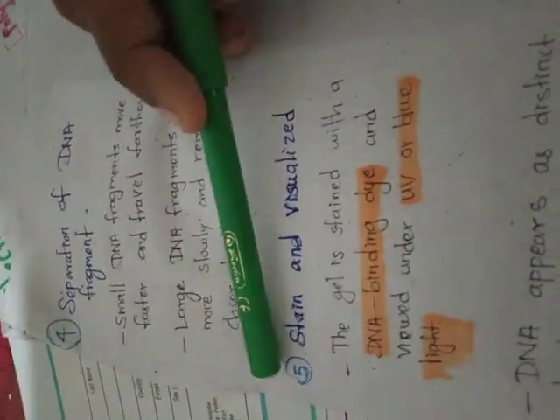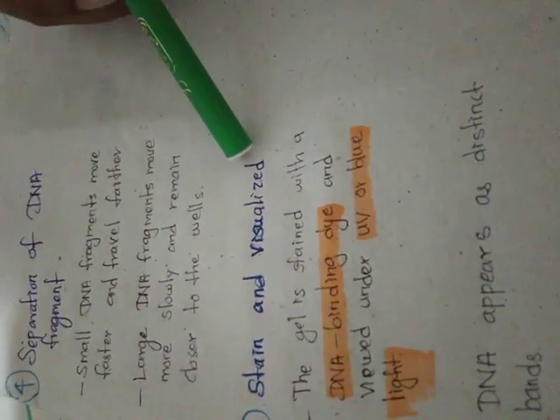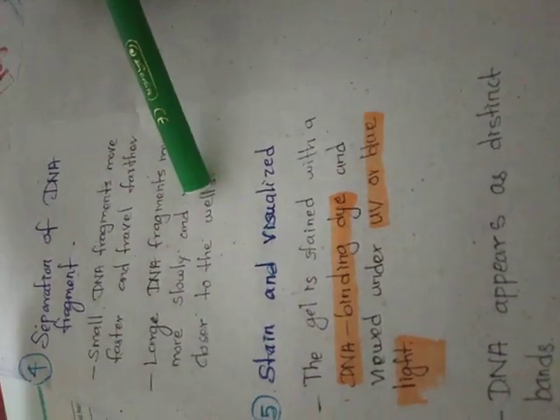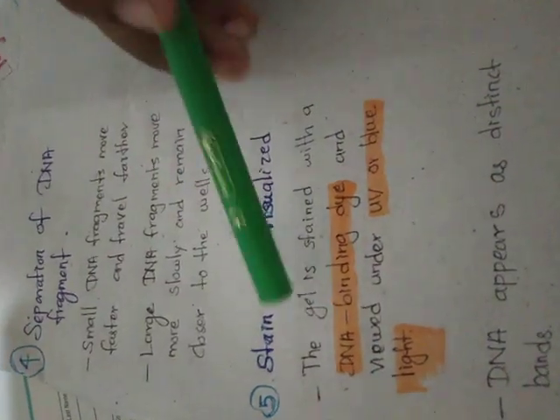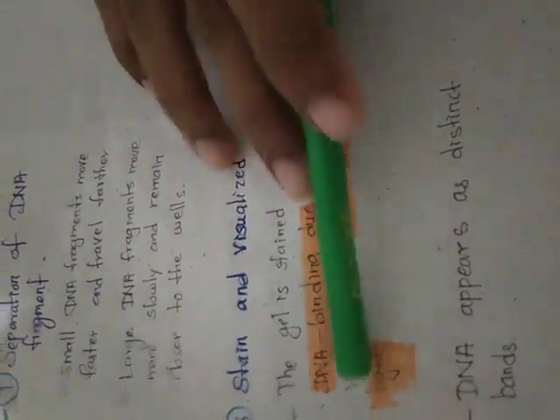Then step five: stain and visualize. How can we identify where the DNA fragments are? So we have to stain. The gel is stained with a DNA-binding dye and viewed under UV or blue light.